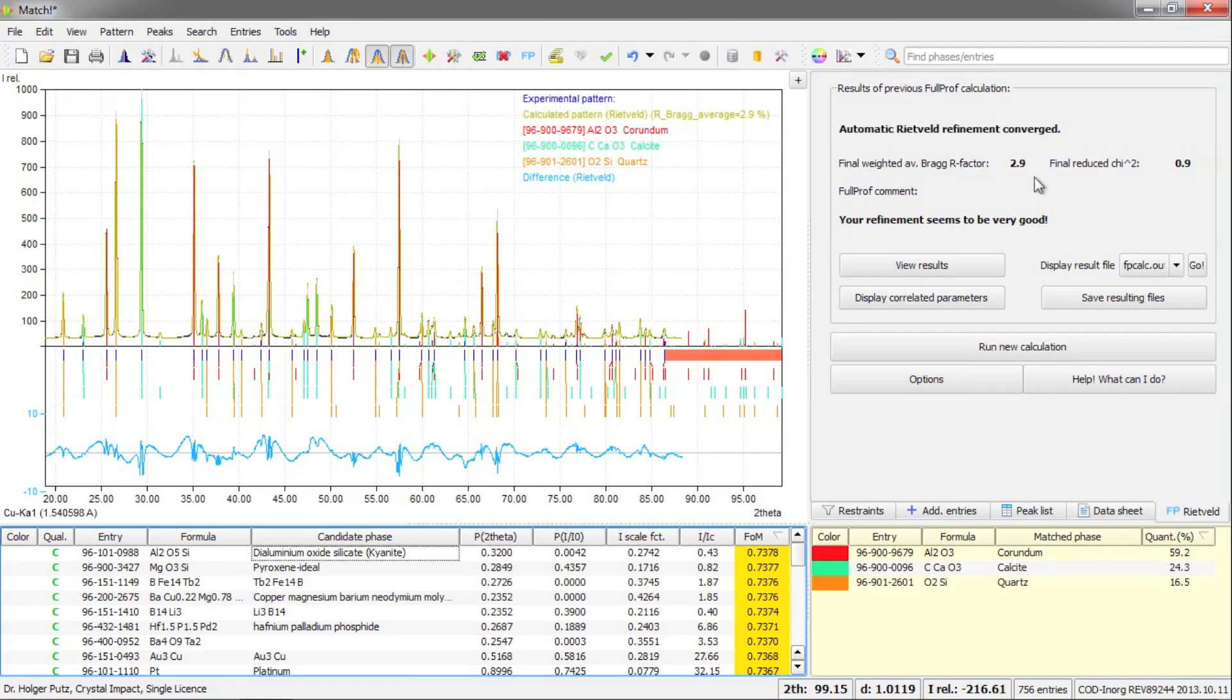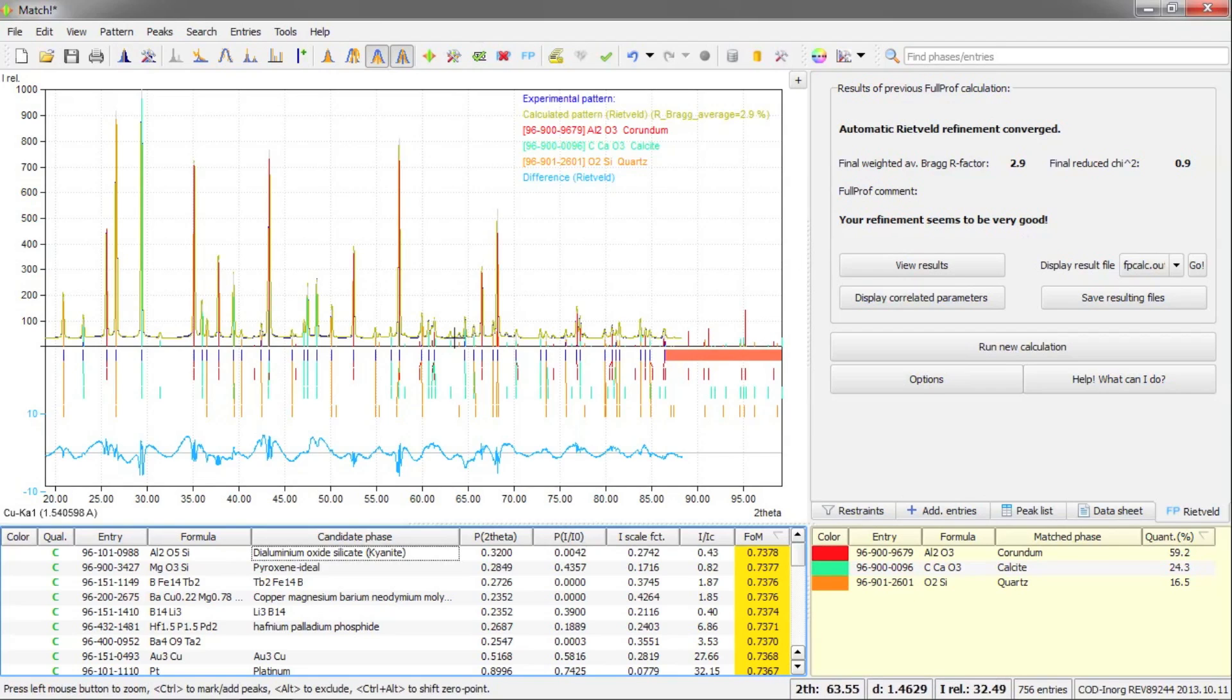We have a rather reasonable R factor and chi-square, and the comment from FullProf is also very promising.